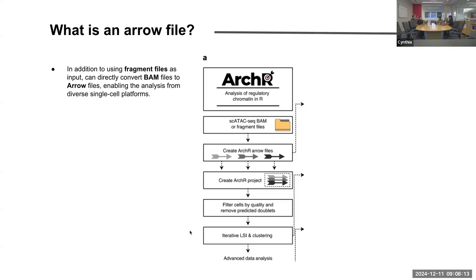before starting the usual analysis to make the normalization, the dimensionality reduction, the clustering, and more advanced analysis.